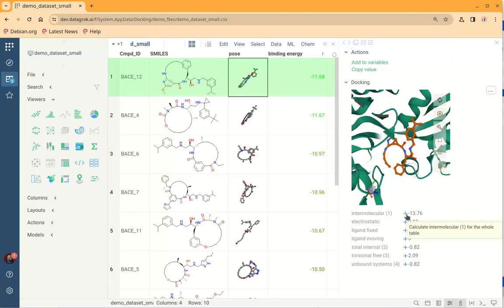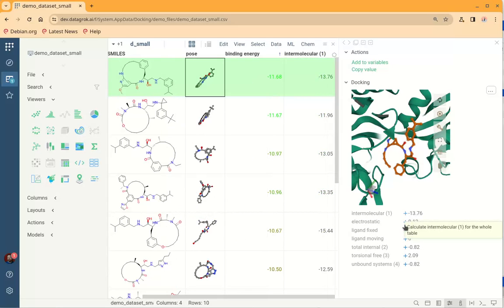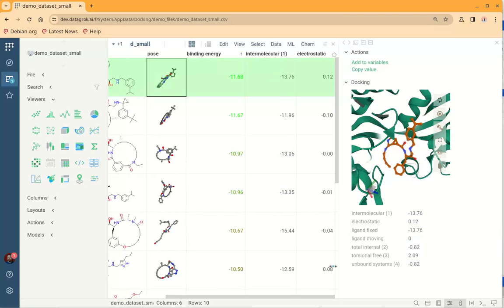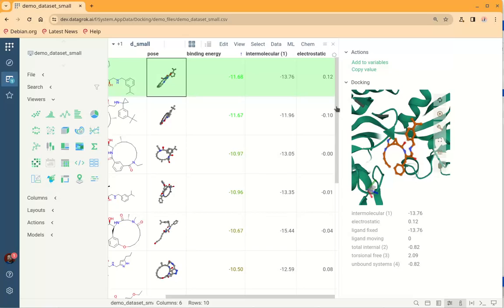Also, Datagrok will show us all energy components of the binding, and by clicking this plus sign we can easily add them to the Datagrok table and then perform any kind of filtering and analytics that Datagrok can do.